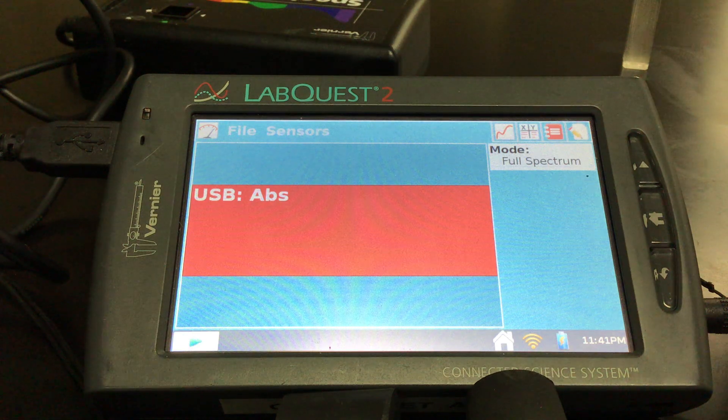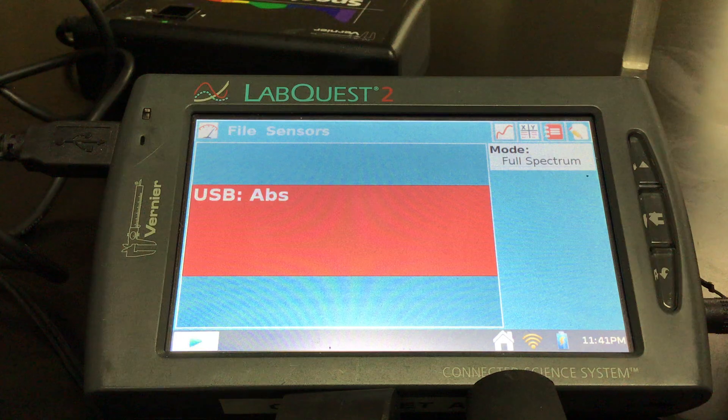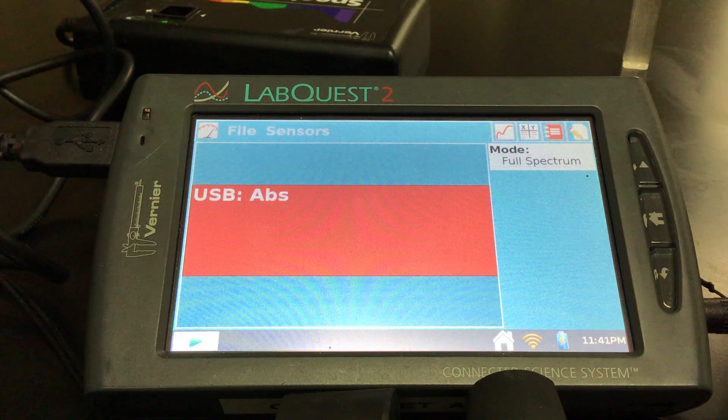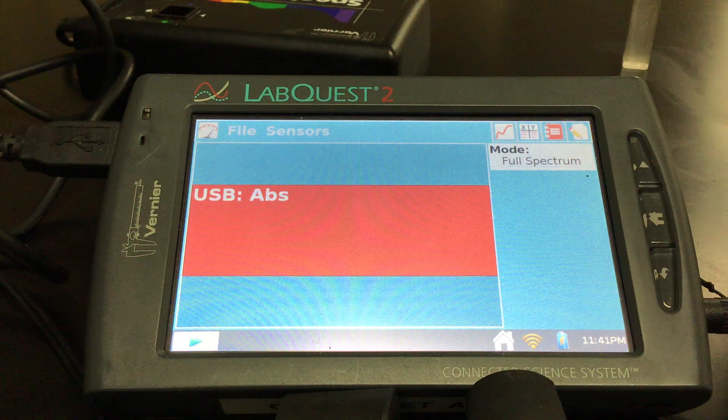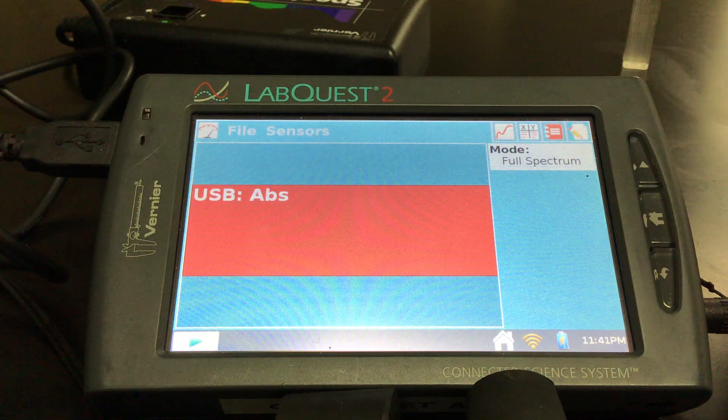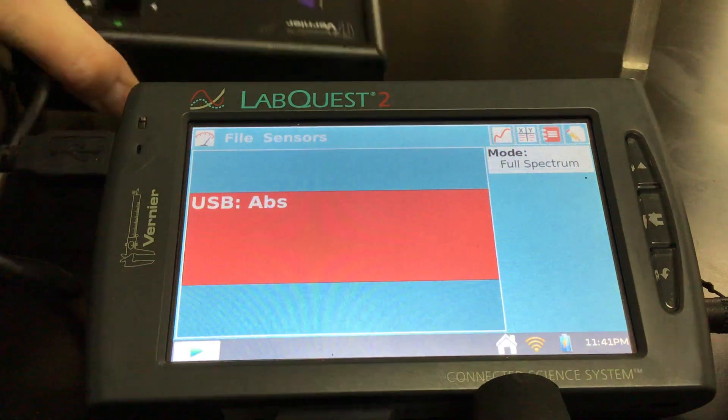Hey everyone, what I'm going to do is go through our crystal violet lab, our kinetics lab using the time-based mode. We're going to figure out the order of the reaction, the rate constant, and some of the analysis. I've put my LabQuest up and I've got my spectro viz which you can kind of barely see in the background.